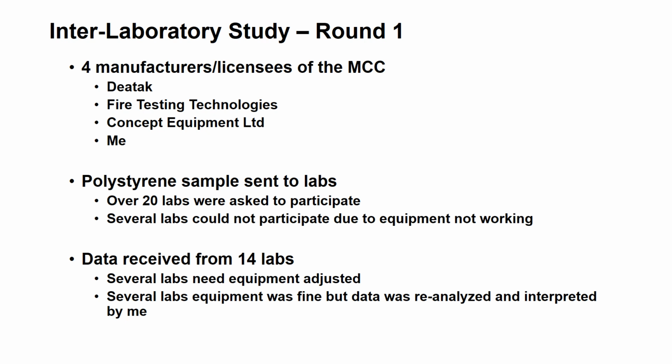So what I did was I took a polystyrene sample, sent it to over 20 labs. Several labs could not participate because their equipment was down and needed service, but I got data from 14 labs. For the most part, the data looked pretty good. Several labs need some minor adjustments, as I'll show you in the following slides. And in other labs, the equipment was fine, but the way they analyzed the data was wrong.